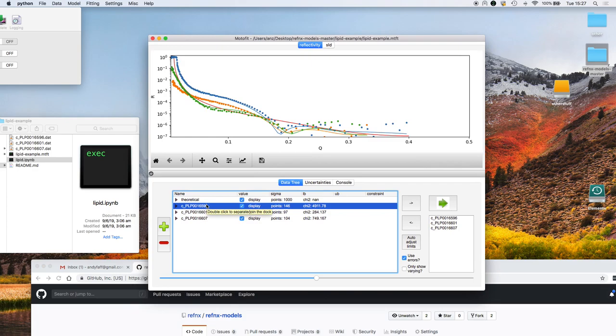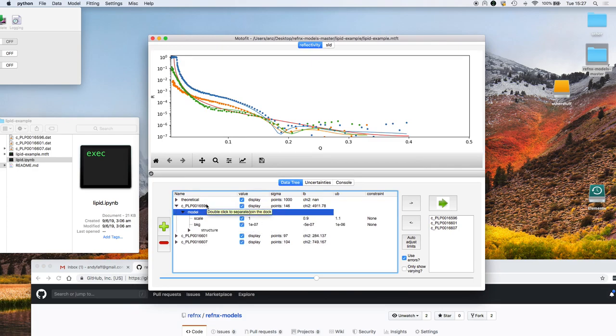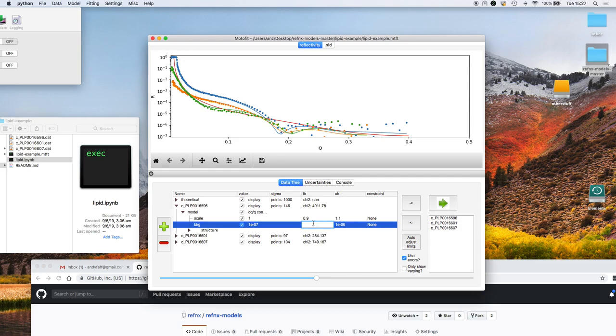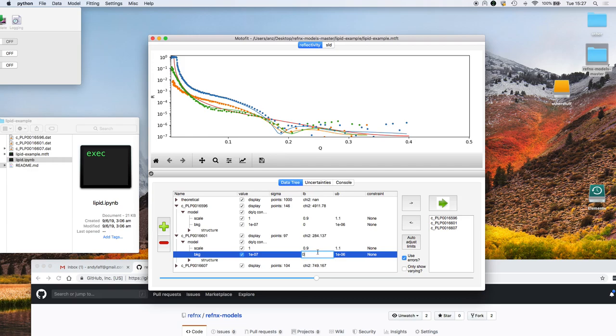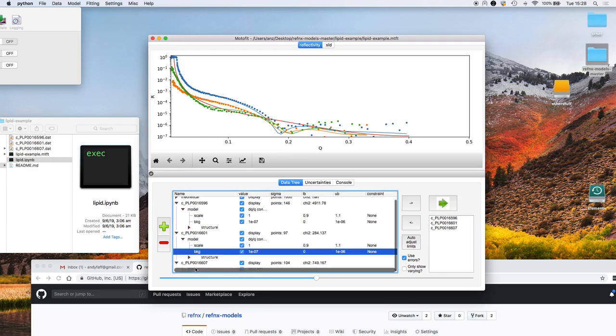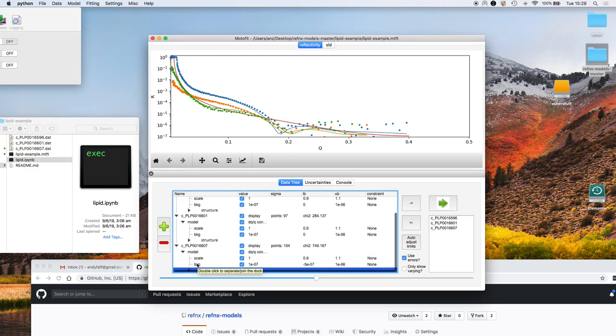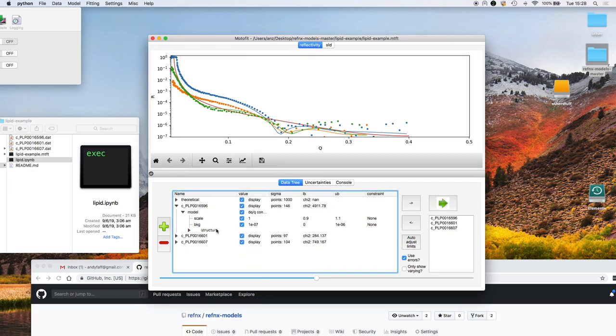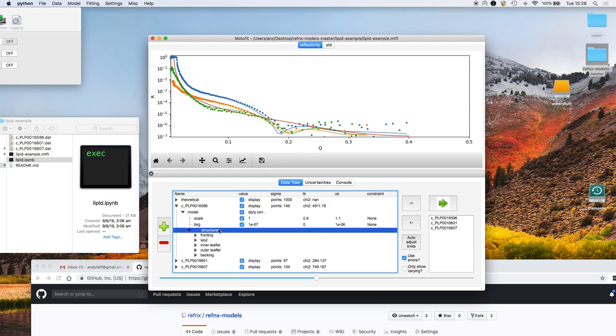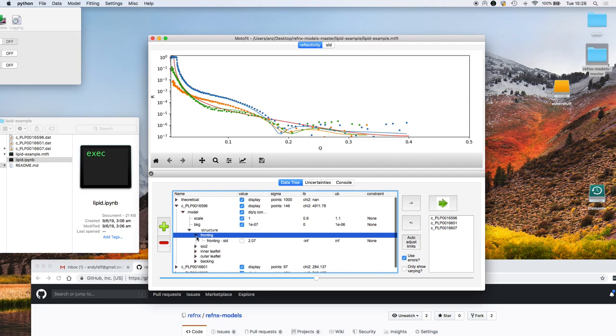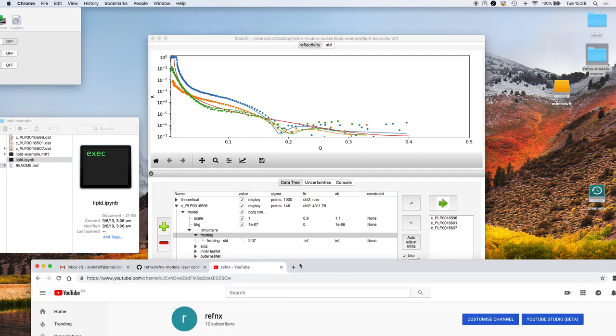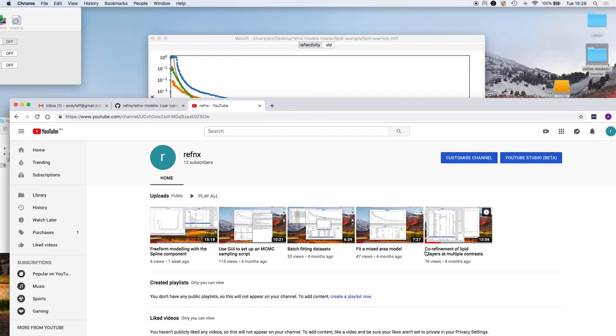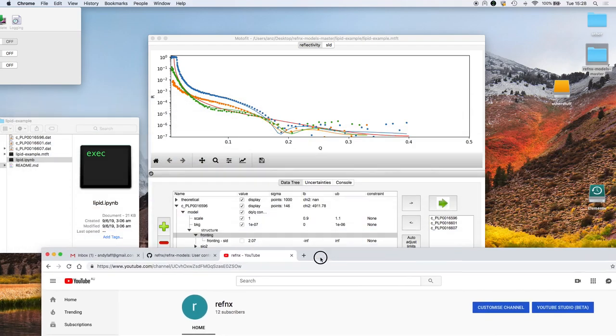The first thing we're going to do is I want to fit log R versus Q, so I'm going to change the lower limit of each of the background parameters to zero. You've seen here that the structure really is a bilayer, so we have the fronting medium which is silicon against silicon dioxide and inner and outer leaflet of the bilayer followed by the backing medium.